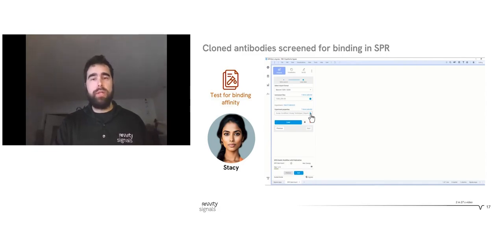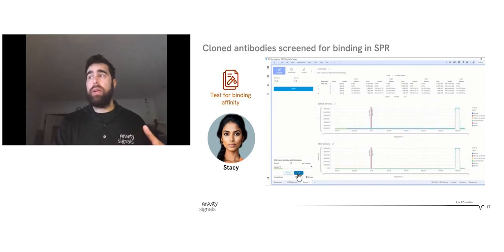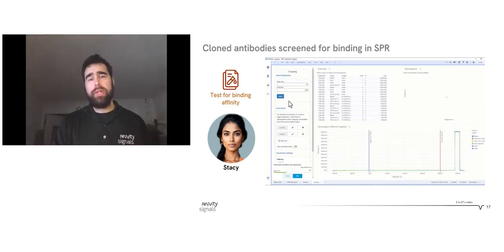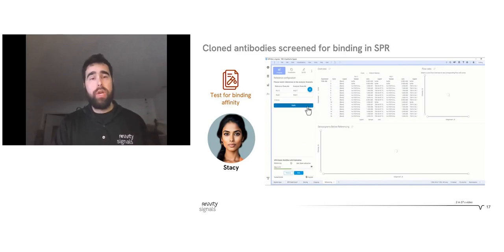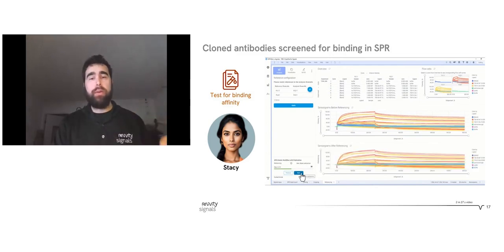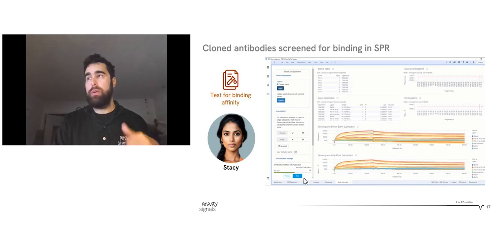So the raw data is viewed here, and it goes into the normal steps performed in SPR, including zeroing, where we can select the part of the SPR curve and everything will be baselined against. We'll be doing, I think, cropping, which is showing next, where we can take the full SPR flow cell and focus on the subsets of space that actually have the data of interest. Then we'll be doing referencing so that each of the flow cells can be correctly referenced to its reference flow cell for intra flow cell data visualization, and then normalized or blank subtracted to normalize correctly on an empty flow cell data to get the final results, which is, I think, coming here, blank subtraction, yeah.